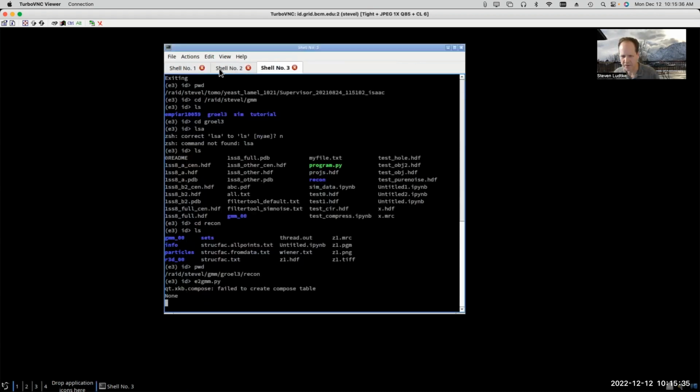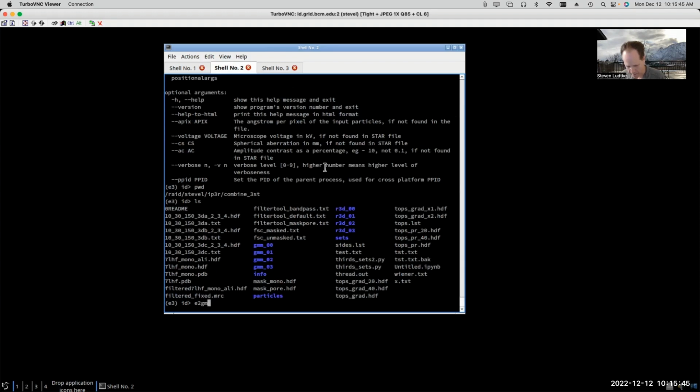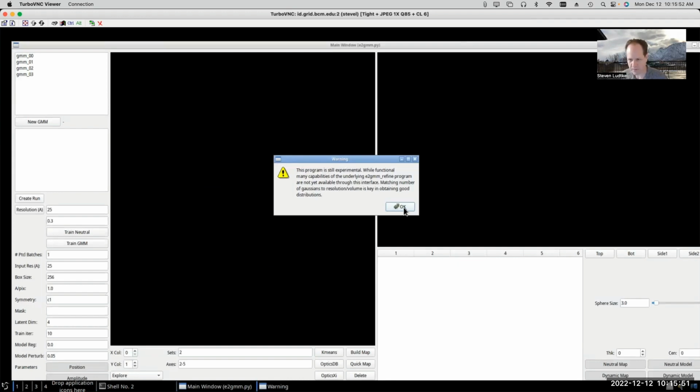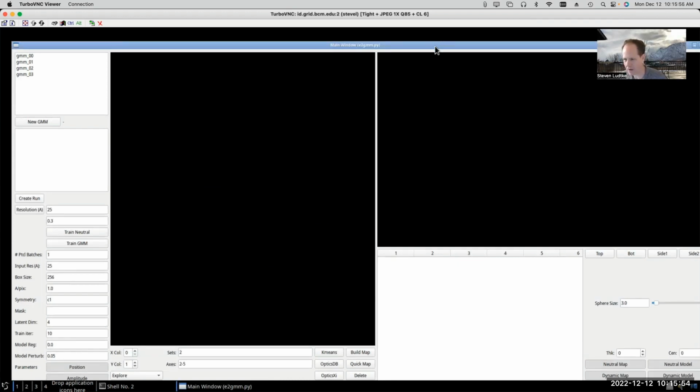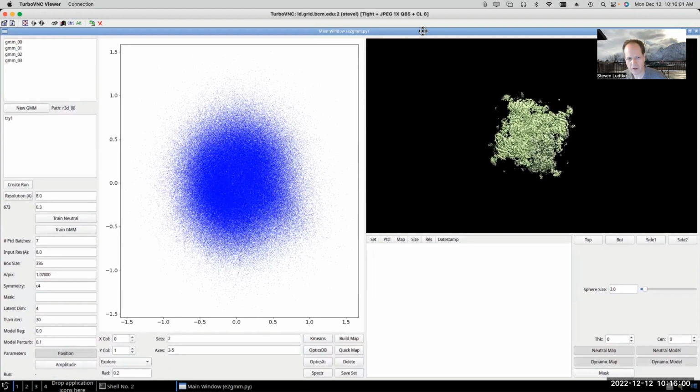I'll take a look at one more data set, which we started analyzing recently, which is this IP3 receptor data set from Marina Sarasheva's lab. This paper was recently accepted for publication, although the paper didn't include very much of some of this Gaussian mixture model stuff that we're seeing here, which is new. So basically, this was 3 different biochemical states of an apo state, a state designed to trigger the channel to have a high open probability, and then a higher calcium state, which was designed to then force the channel to close again.